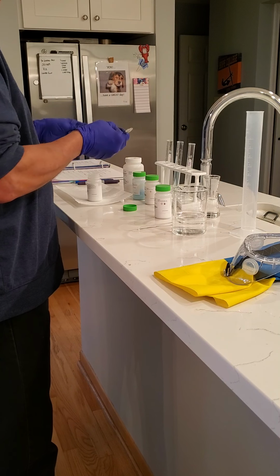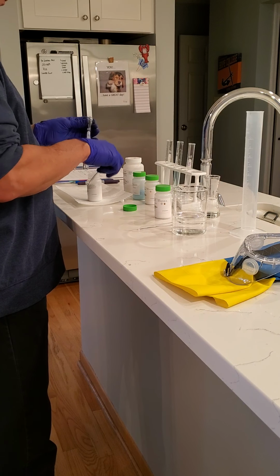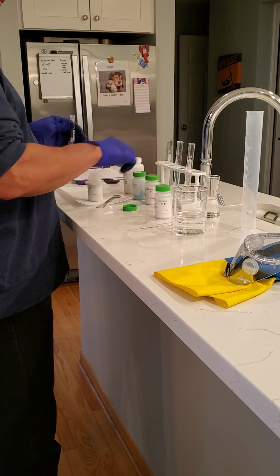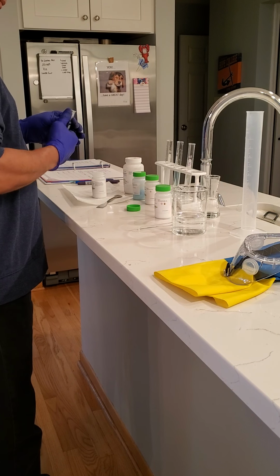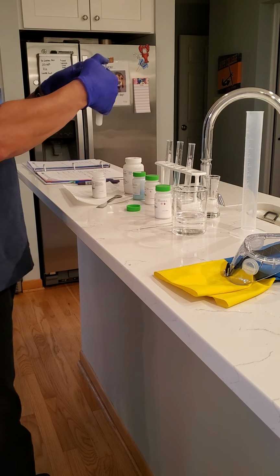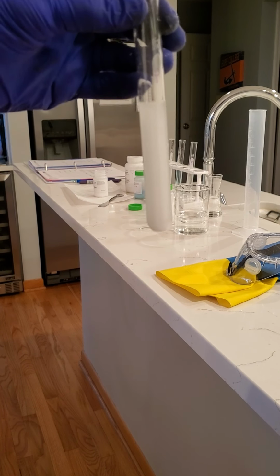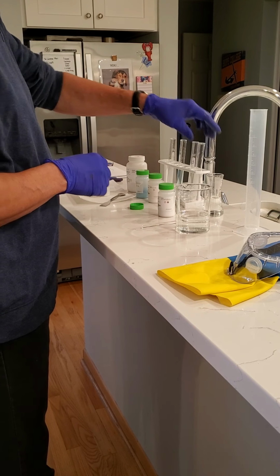And we'll add a little bit, about half of a spoonful of the potassium bitartrate. Cover up with our thumb again, upside down, shake, upside down, just to mix it to see their solubility. And you can see how that was looking. So you make your observations on your own for your test tubes.